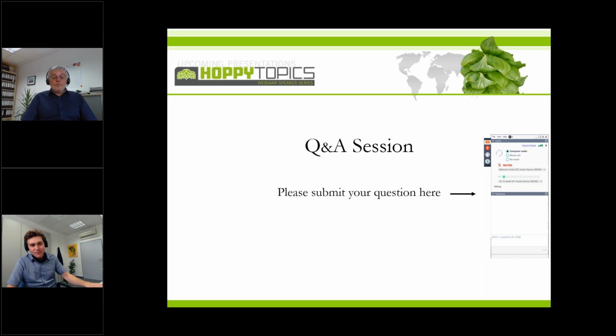Okay, picking up the issue that there are a lot of alpha acids in dry hop beers, the question came up: is there any connection to the foam of dry hop beers? Do you have some more data on that? What do you think? It's a controversially discussed issue. Of course, alpha acids improve the foam, but after dry hopping you get such a complex mixture in the end. We may have foam stabilizing effects, like alpha acids, and destabilizing effects.